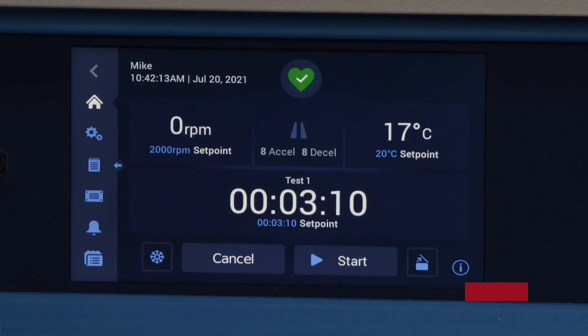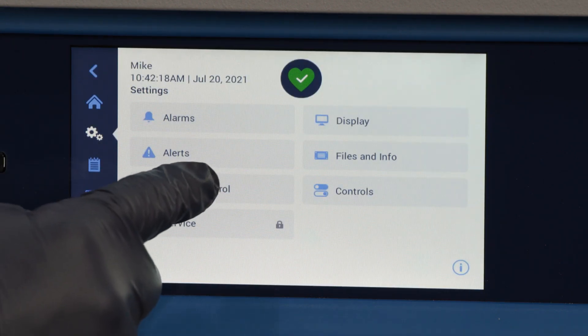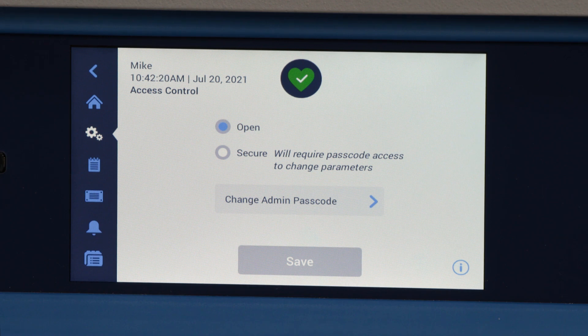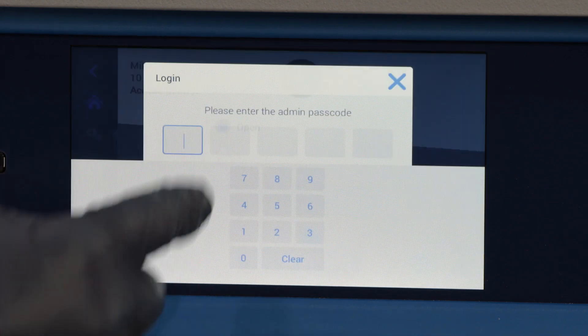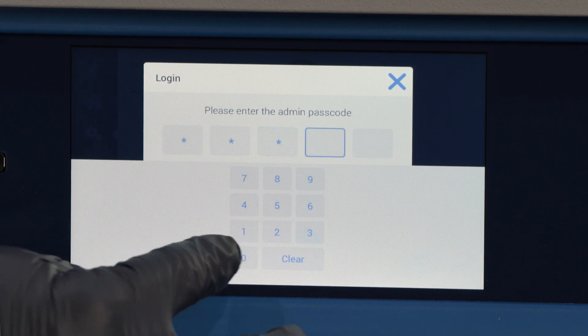The X-Pro units have heightened protocol security functions with access control. The access control function gives you the option to set the unit in secure mode. Secure mode will request a password from all users to operate the advanced features of the centrifuge or to change settings.